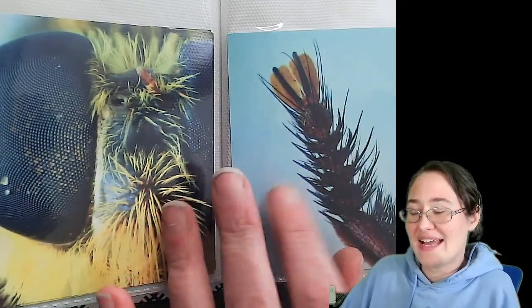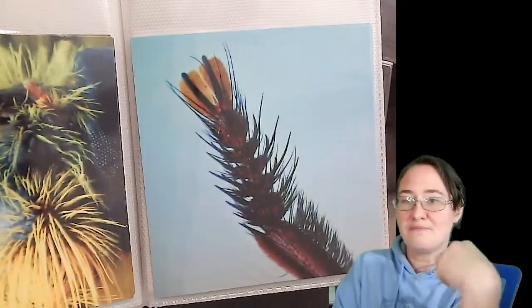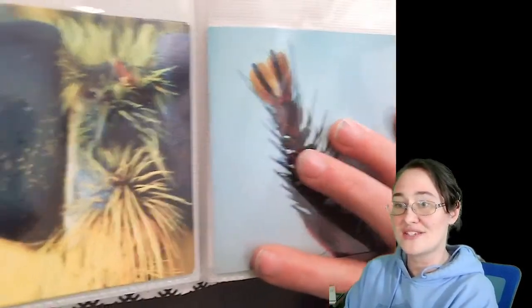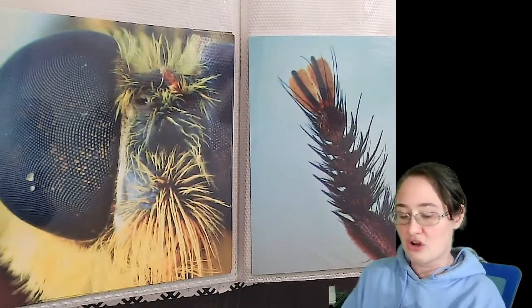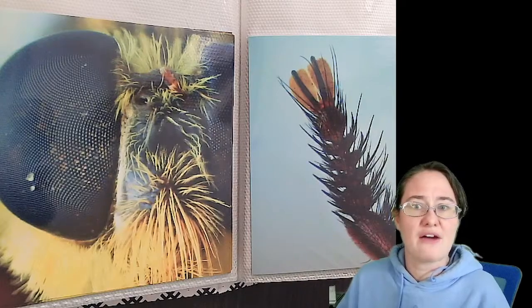I have not figured out... I have not posted these for sale on my website yet. The plan is to post them for sale on my website. Oh, this is a really cool picture of pulvilli, by the way, those little pads underneath the tarsal claws. I have not yet posted these images to my website, but if you already know people who are interested in buying prints, or you want to talk about them, I'm cool with that, and I will figure out how to make that work.